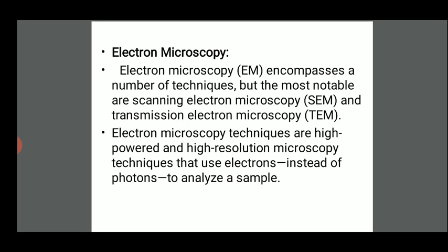In both SEM, that is scanning electron microscopy, and transmission electron microscopy, an electron gun fires the electrons through a series of optics, and this focuses the electrons towards the nanomaterial. So we'll study in detail about these things, the optical microscopy as well as scanning electron microscopy, in today's session.